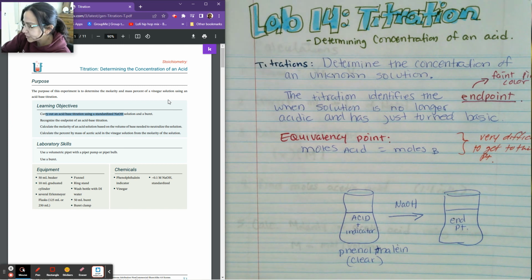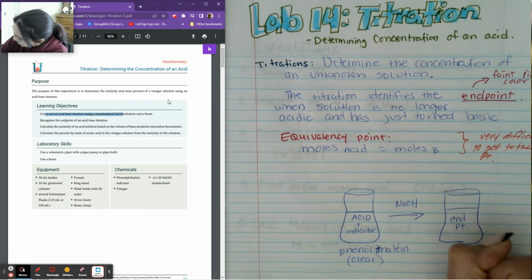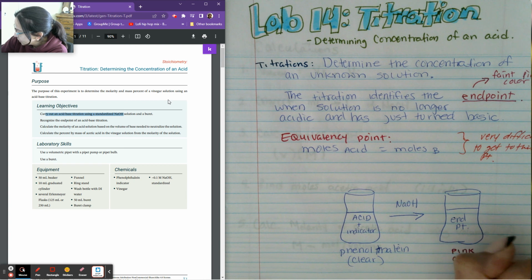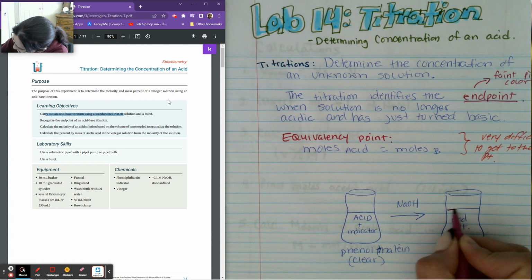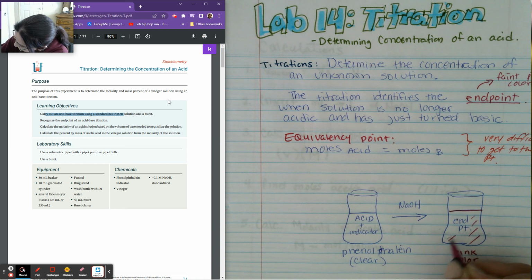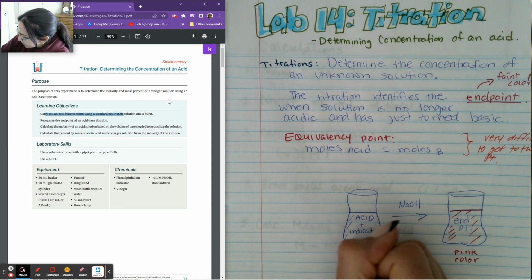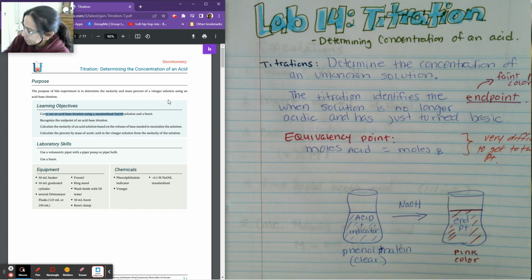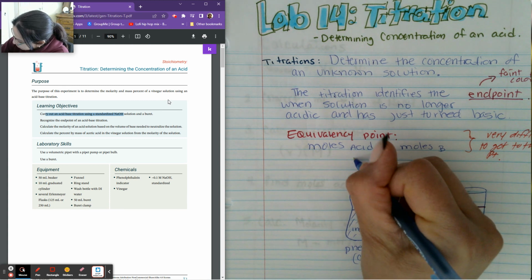So it's just going to be a pink color, and that's going to be the endpoint when you reach it. And this one is clear.